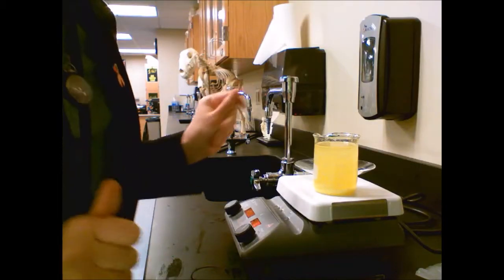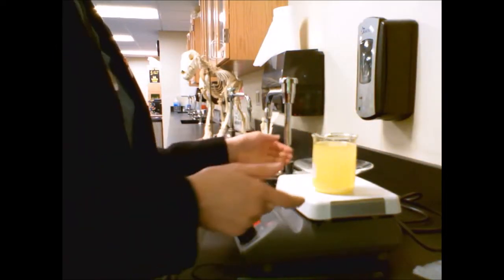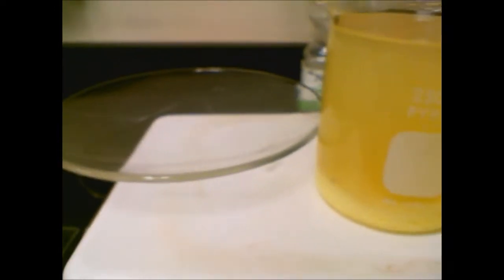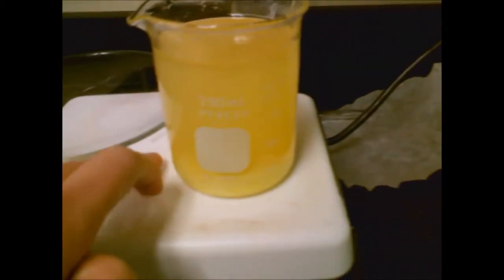All right, so I've let it sit. I decided to set this back up on the hot plate. Both items are on the hot plate. If you cannot see, I shall move you closer. Neither is going to be at exactly 80 degrees Celsius because they're off center, and it's pretty much only the center in this case that gets really, really warm.